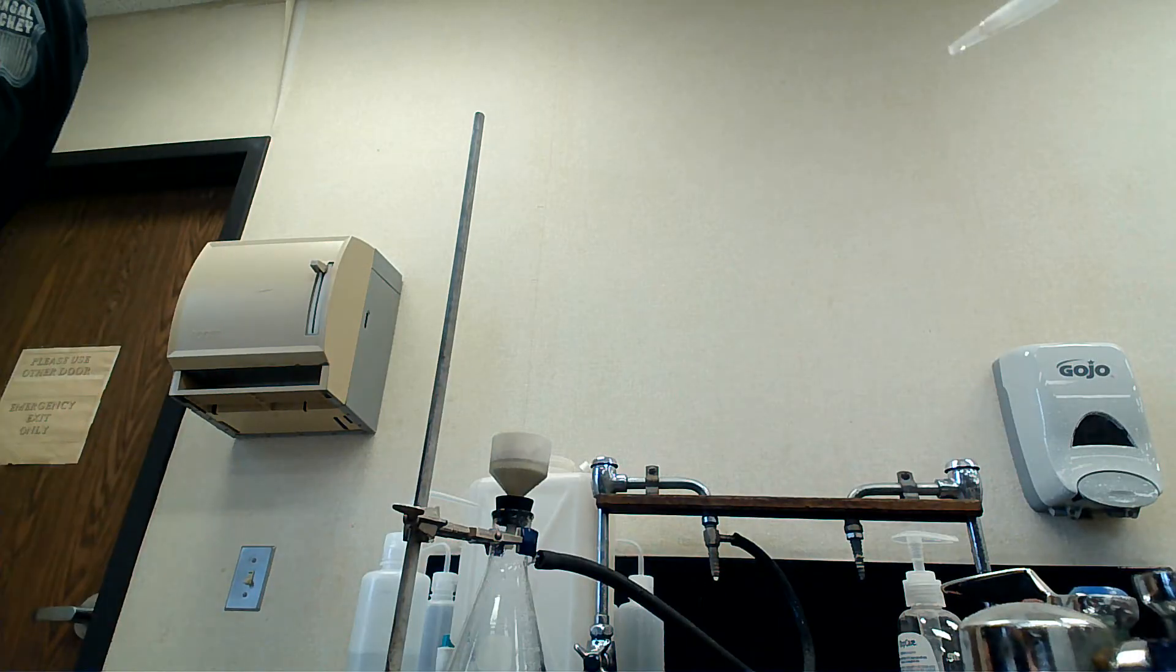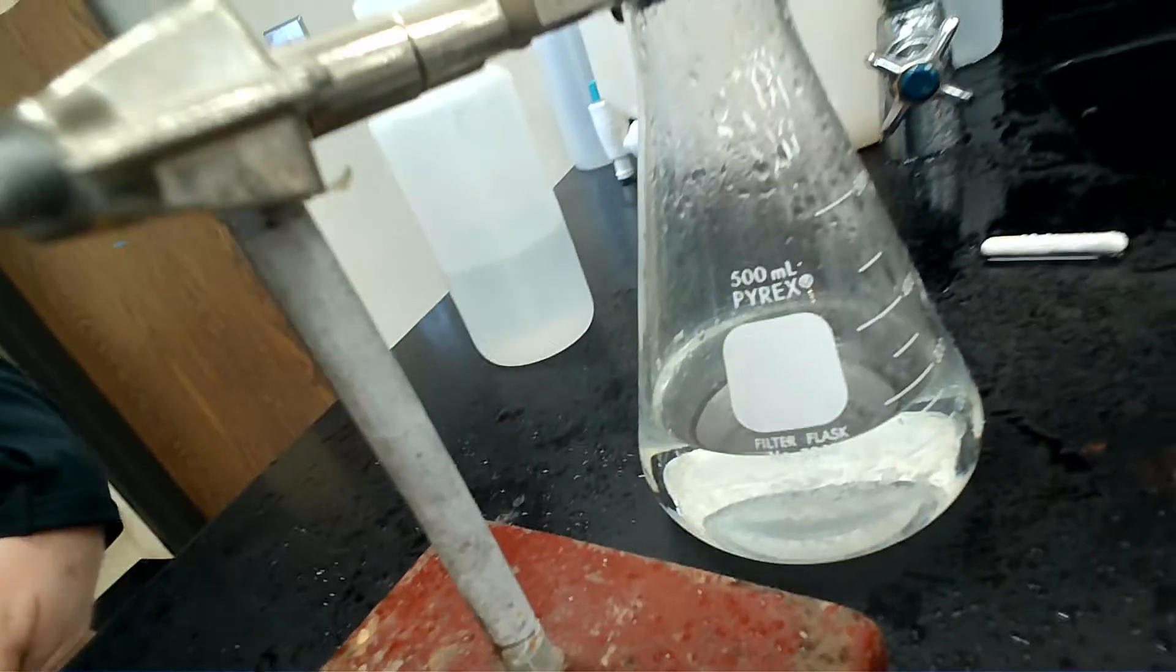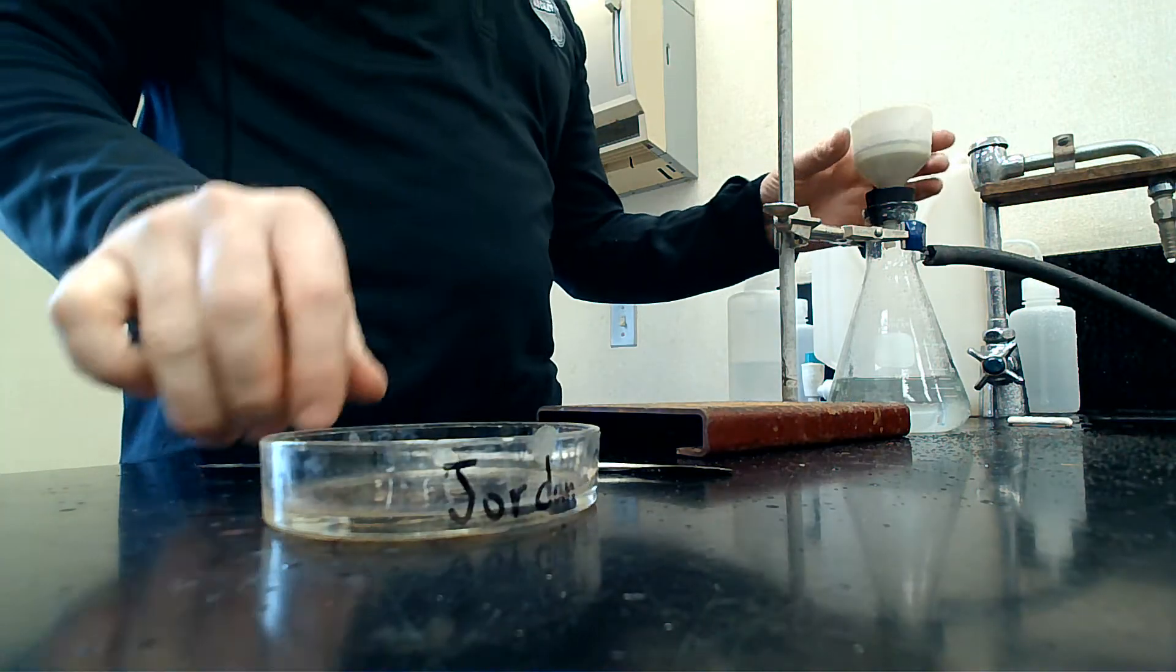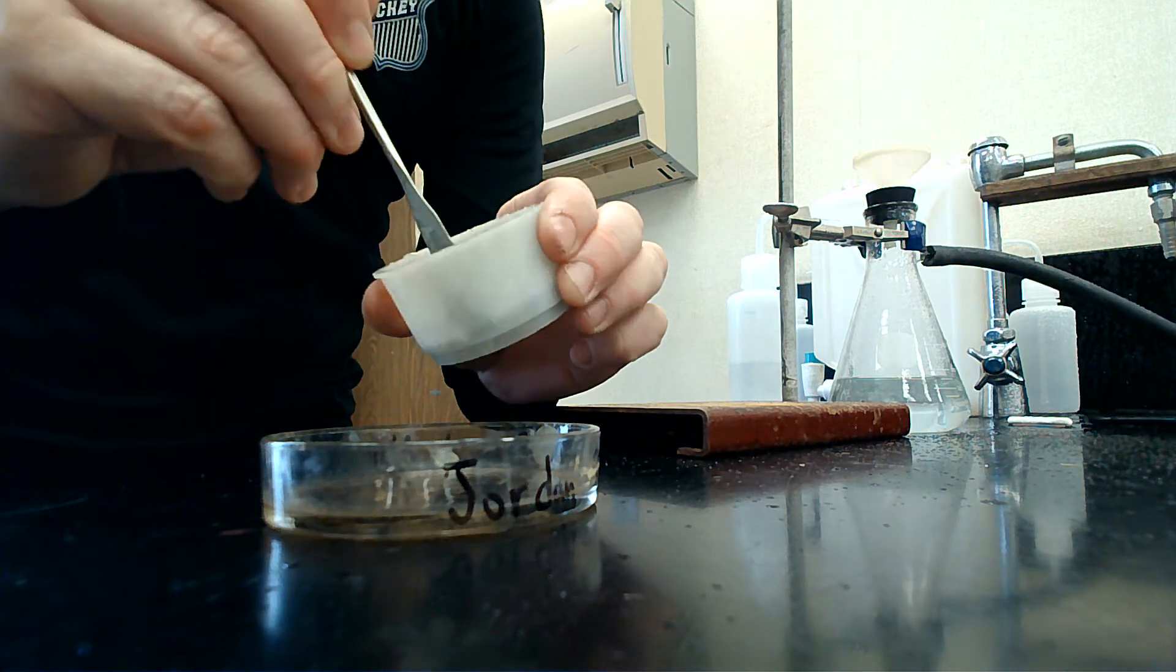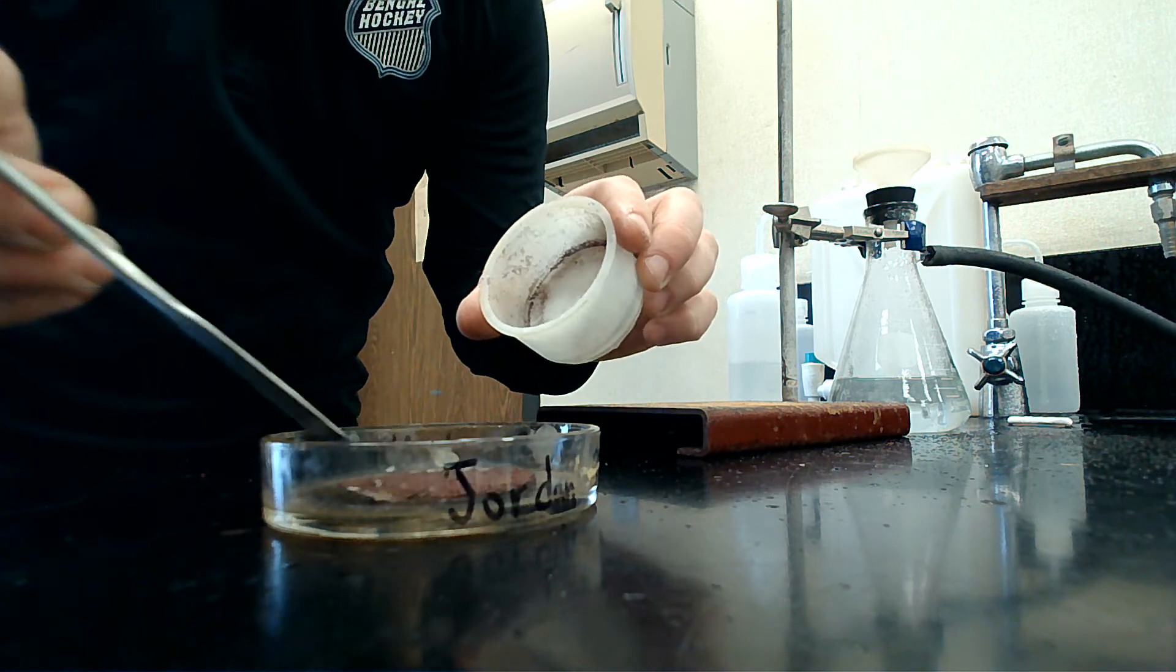We separated the solid. You can see the clear zinc chloride solution on the bottom and the copper up top. Now we're going to put our copper into a petri dish and dry it out to get a mass of it.